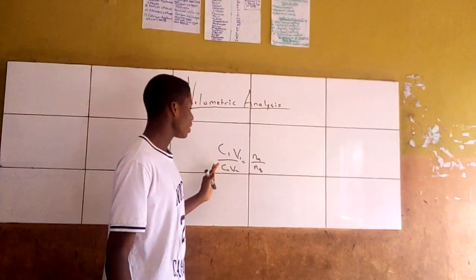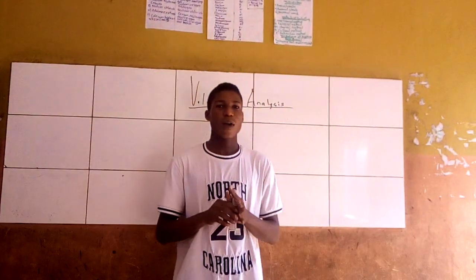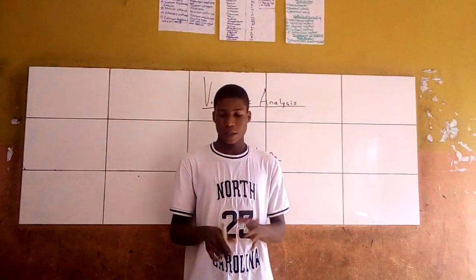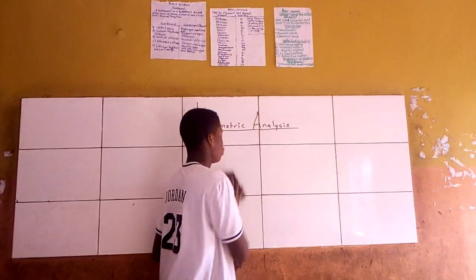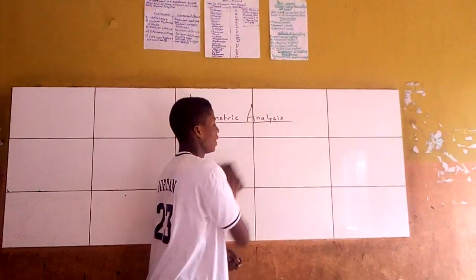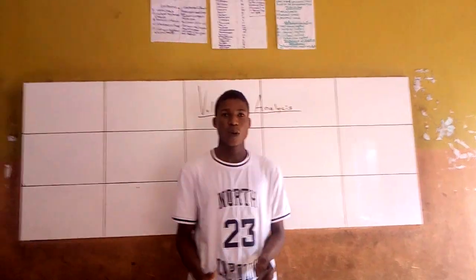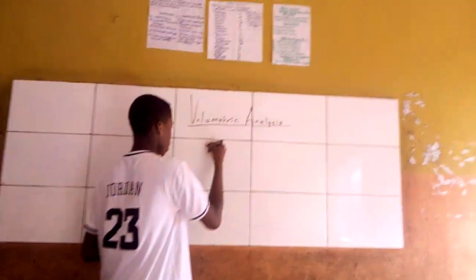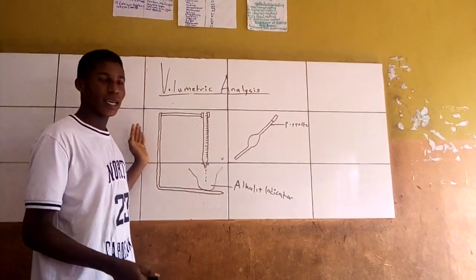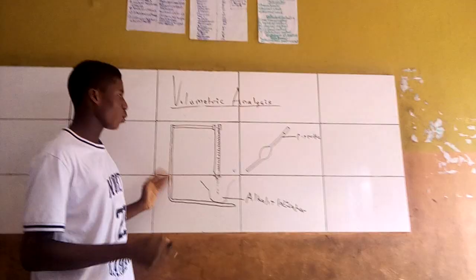So I would like to illustrate how the titration will be done, because the titration experiment we will not explain to you at that period. So I'm taking my time now to explain to you. So in the titration experiment, let me draw. So this is how the titration experiment will look like.